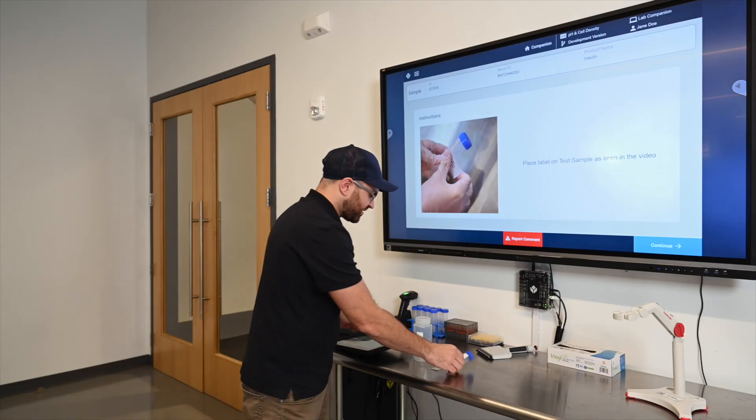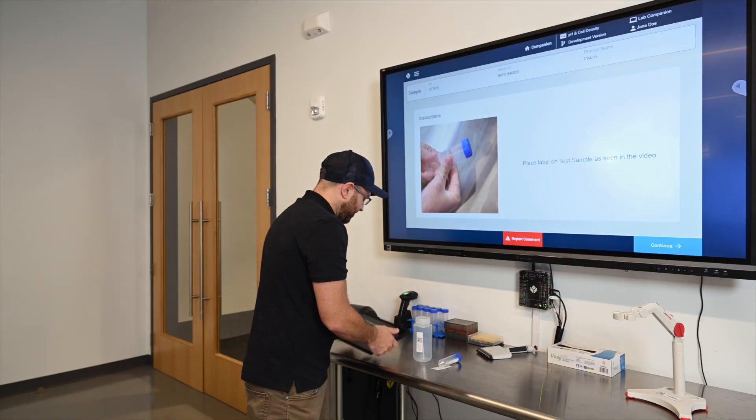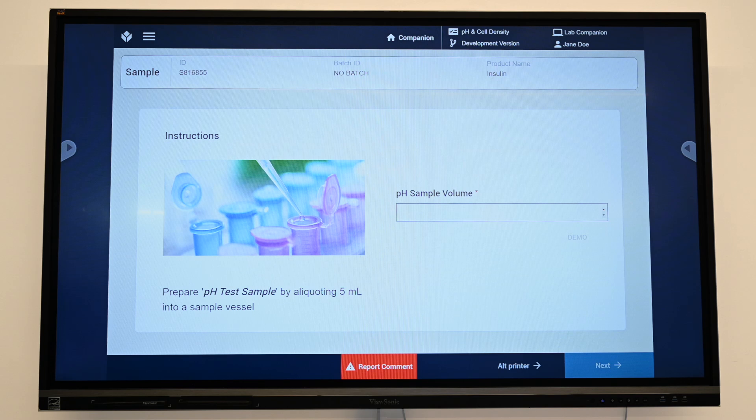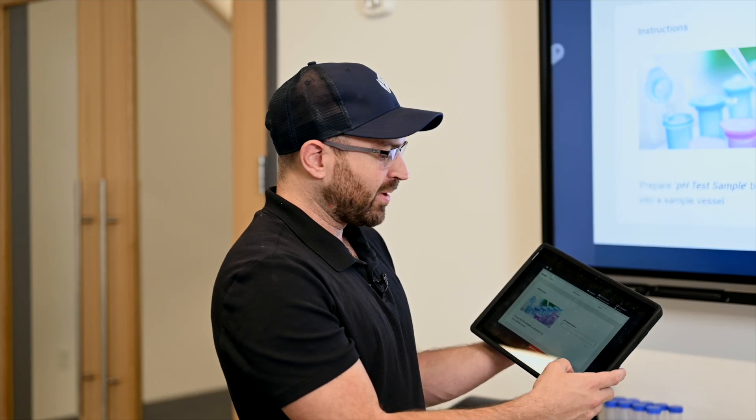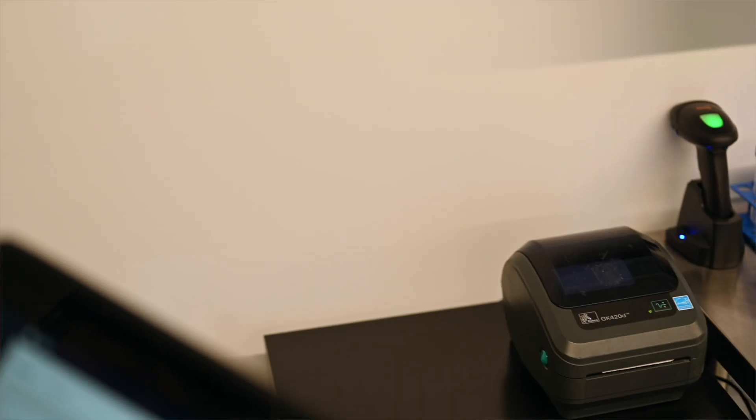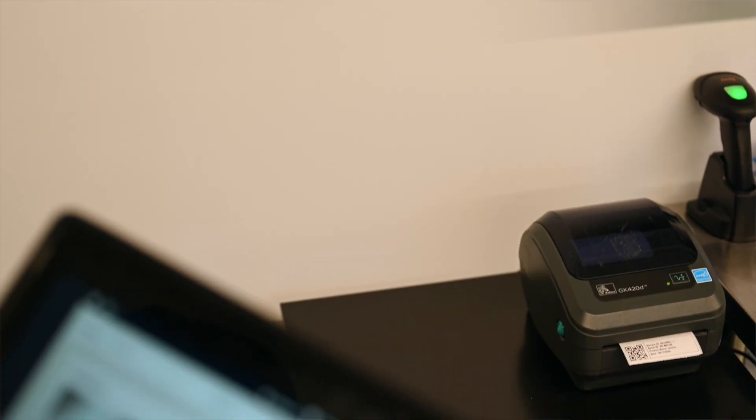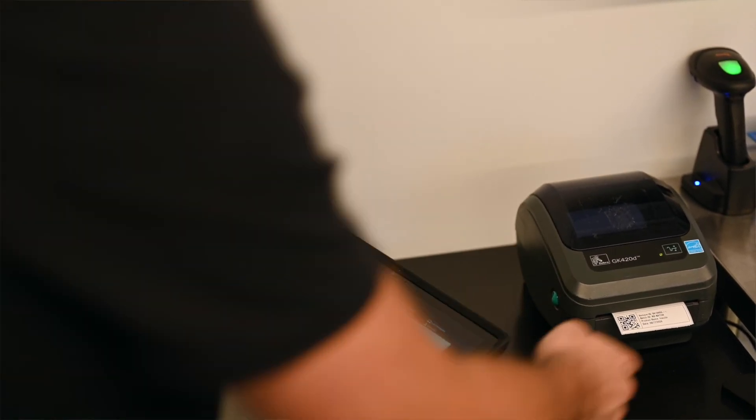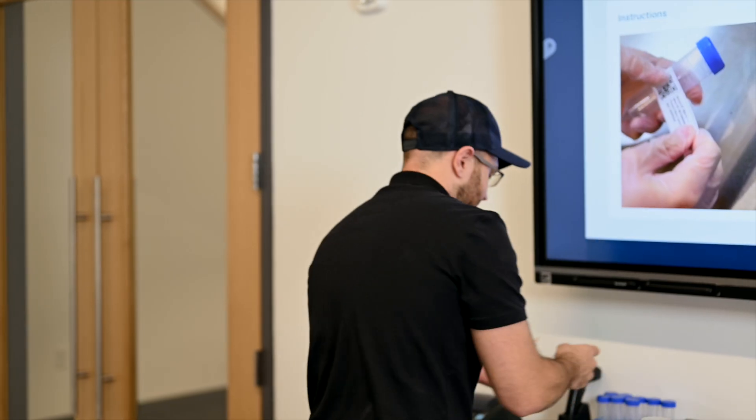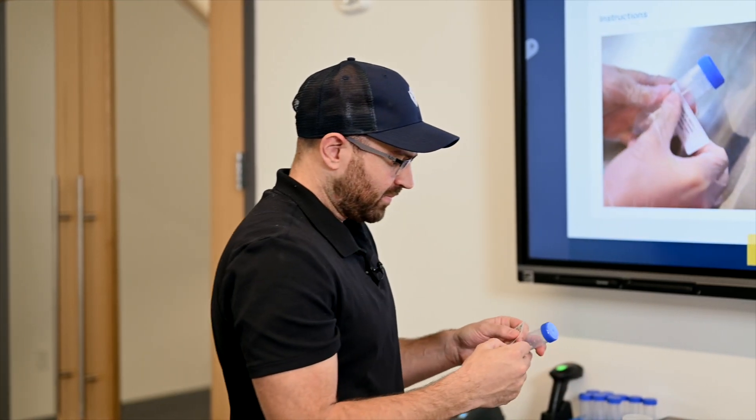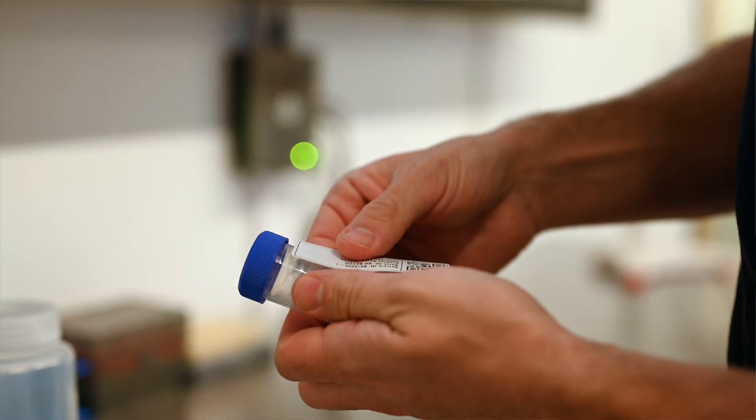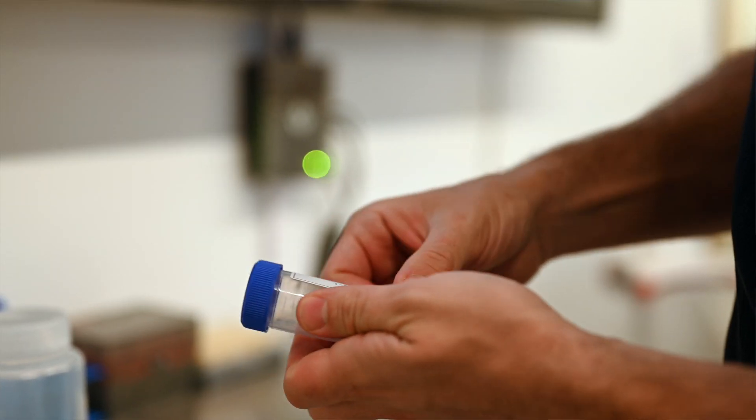The next step in this aliquot procedure is to take out the pH test sample. So I'm going to aliquot five milliliters. Again for demo purposes I'm just going to go right through this and print off my next test sample.